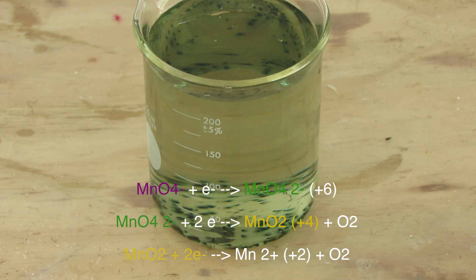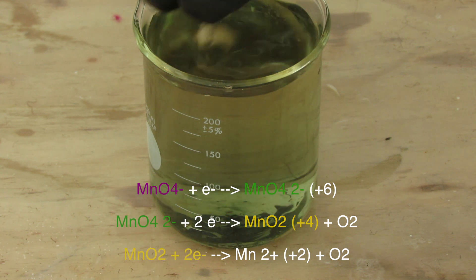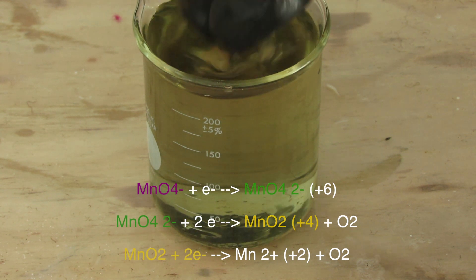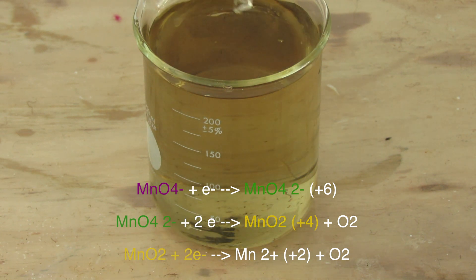Here's what's actually happening. The manganese is reduced by the sucrose with the aid of sodium hydroxide as a catalyst. It goes through different stages of oxidation, which is why the color changes.